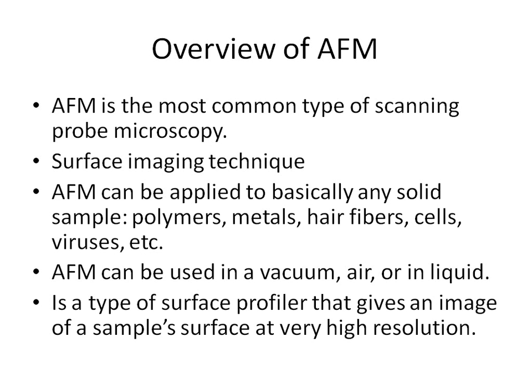For AFM, almost anything that is solid can be used as a sample. This includes polymers, metals, hair fibers, nucleic acids, proteins, minerals, and lipid bilayers, which is what we used in this research article that I'll explain later. It can be used on cells, viruses, bacteria, plant surfaces, anything like that.